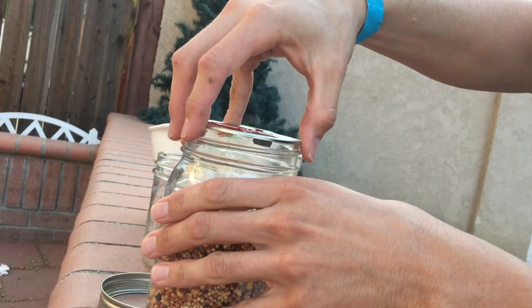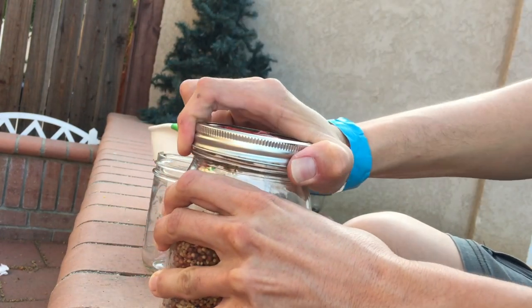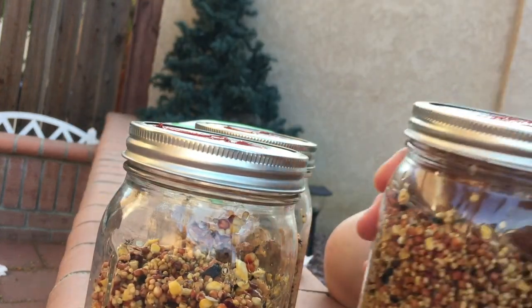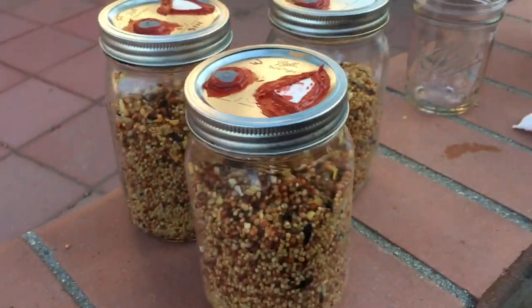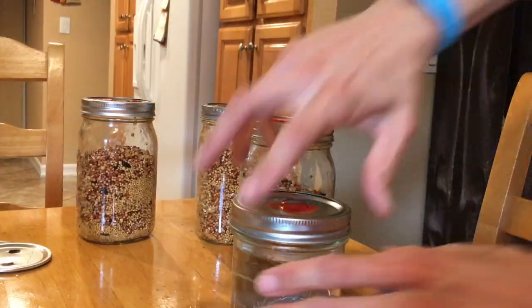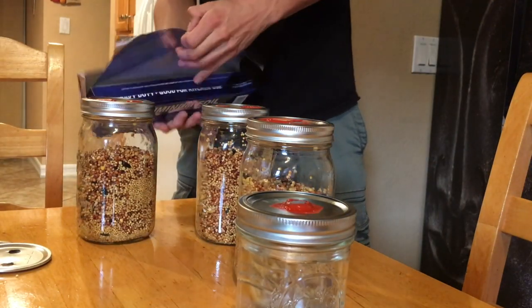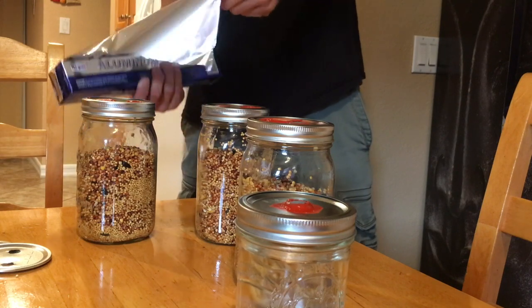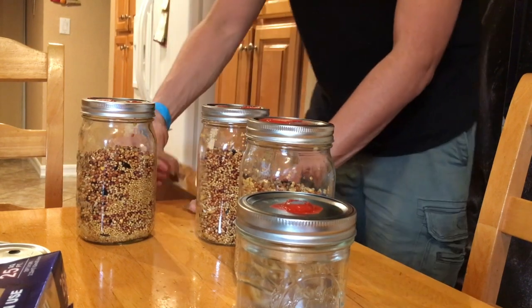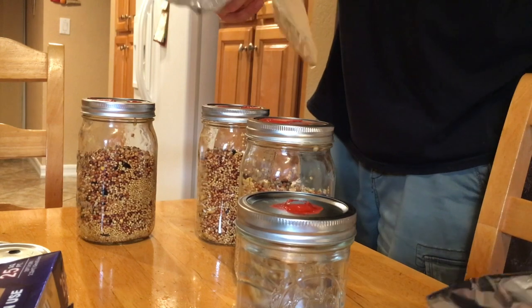Cover it up and close the lid — and that's done. Now I have three jars of grain spawn. I'm going to grab some foil and cut it in one big piece, then cut that bigger piece in half, and that half into another half.